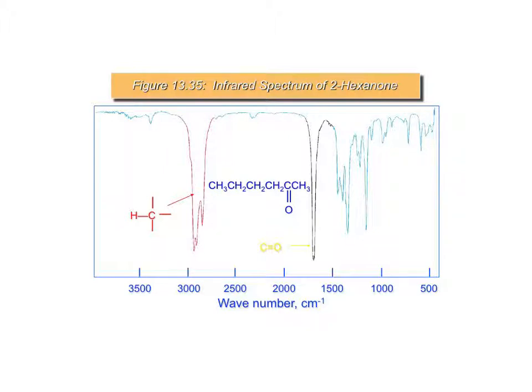Yes? I'm confused about bending and stretching. How do we tell, what do we need to know about that? So I just want you to know that IR affects the bending and the stretching, okay? That's just a little bit of the theory behind it, but I'm not expecting you to know, okay, this peak right here is due to the bending of the carbonyl bond. You don't need to know that. Yes. It's a general trend that the bending will be closer to the fingerprint area? Right, just in general. But once again, I would never ask you specifically what this peak goes to.